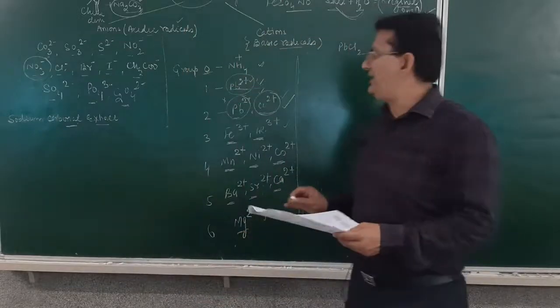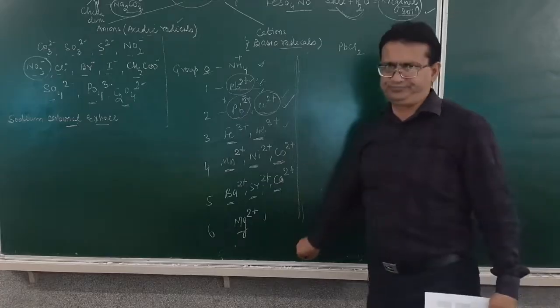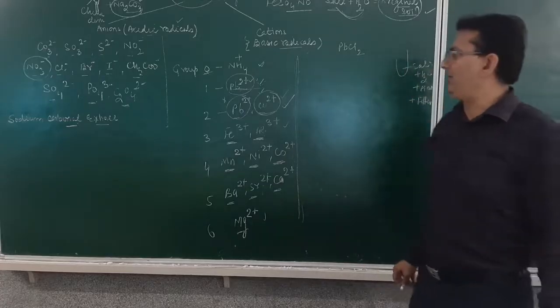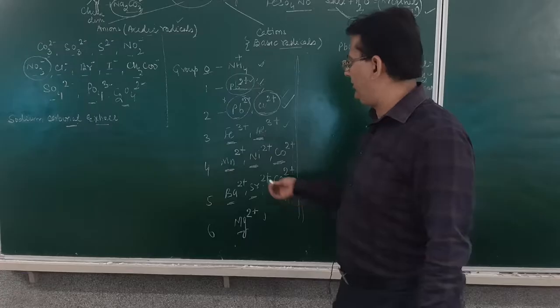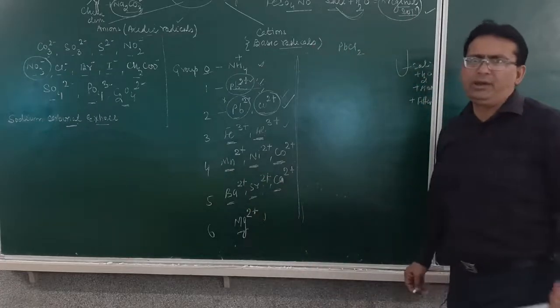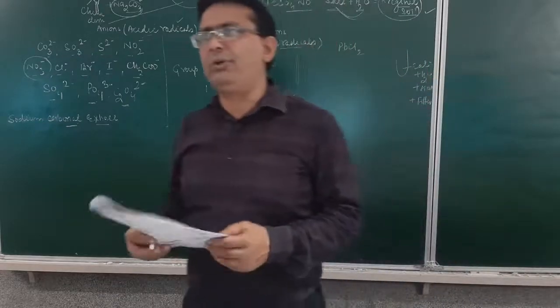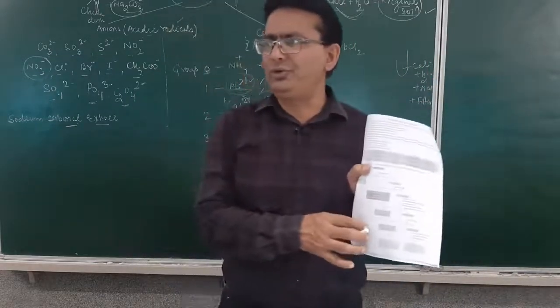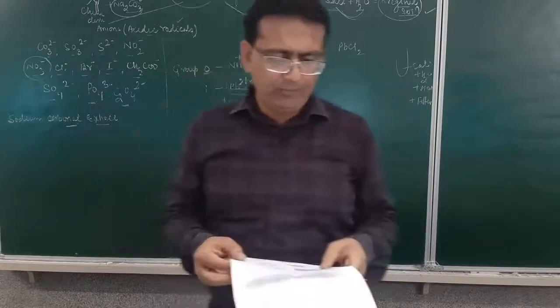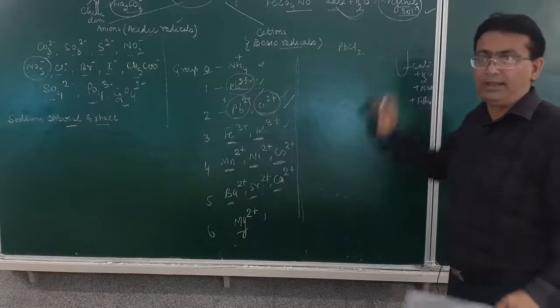Now, the various cations in the syllabus are classified into various groups. These are ammonium, lead, copper, ferric, aluminium, manganese, nickel, cobalt, barium, strontium, calcium and magnesium ions. How do you do this? You may look at the table given to you. Look at this table provided to you. Now see over here, what do we have? We have our original solution. We prepared this solution. Am I clear?